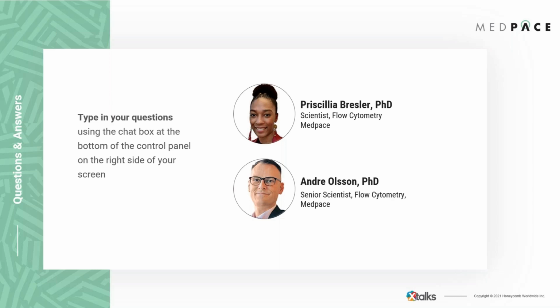If the stability is not found, you can collect the blood, for example, if you are using blood, using Streck tubes, and these Streck tubes contain a stabilizer. Then you can push the stability to more than 10 days. However, this can be a bit risky because the stabilizer can impact the extracellular receptor detection and then impact the RO.